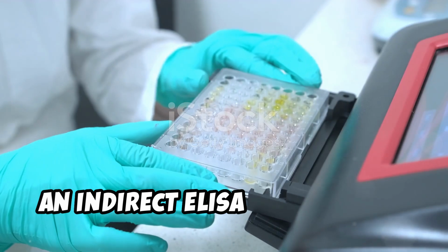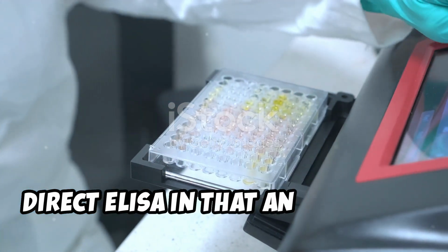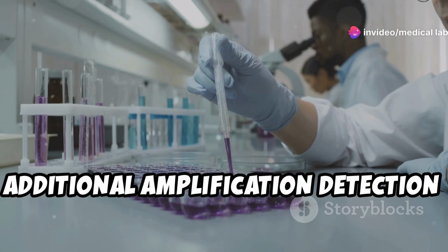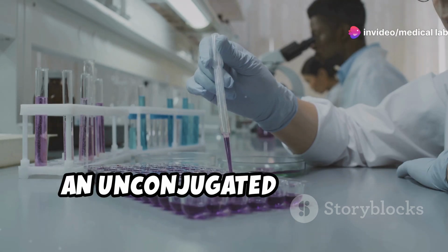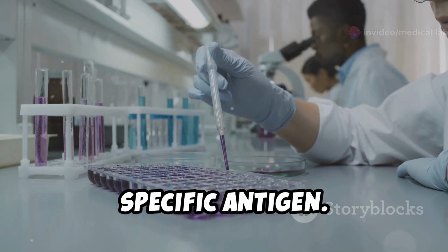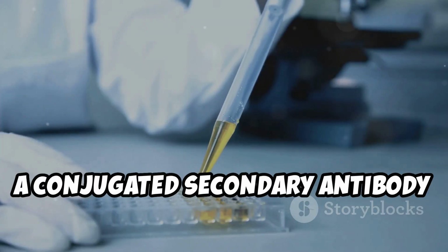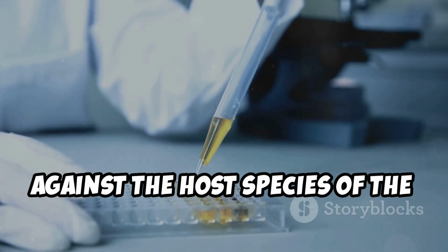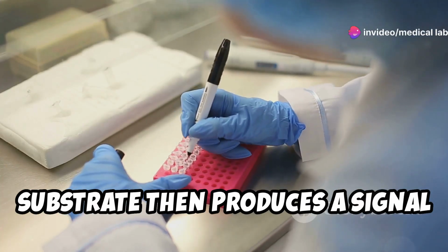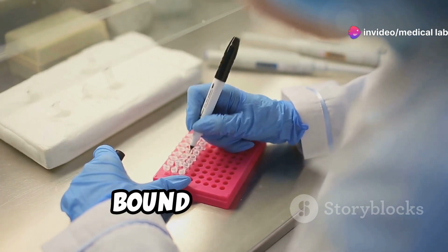An indirect ELISA is similar to a direct ELISA in that an antigen is immobilized on a plate, but it includes an additional amplification detection step. First, an unconjugated primary detection antibody is added and binds to the specific antigen. A conjugated secondary antibody directed against the host species of the primary antibody is then added. Substrate then produces a signal proportional to the amount of antigen bound in the well.